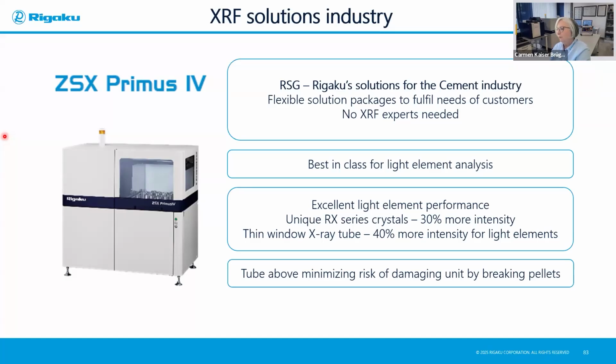The balance of the material in this case would be like a loss on ignition. So a loss on ignition would be the portion of the carbonate of the material. Or if you don't have this kind of facility in your lab to do a heat treatment and gravimetric analysis, we could also complement this balance by estimating the balance, by measuring a Compton line. So the Compton line is directly related to the matrix of the sample. And this could also be a way of determining the balance of your material. There are other examples of balance, but that was the one for minerals.